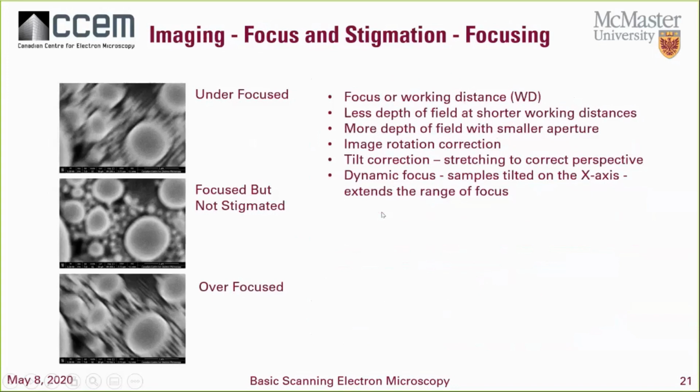One of the biggest problems that we see when we're teaching people SEM is the problem of astigmatism, a distortion of the image, which occurs due to possibly charging effects, or lenses not being ideal for imaging. So quite often when we start off, we're focusing the beam on the sample, going up and down with focus.